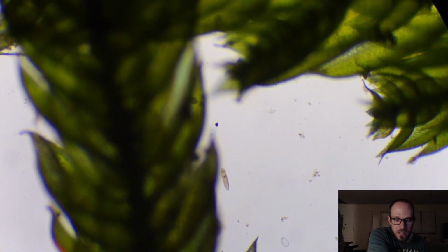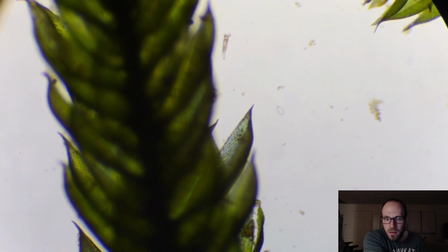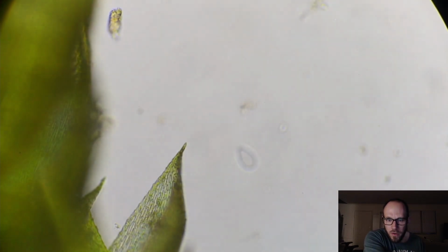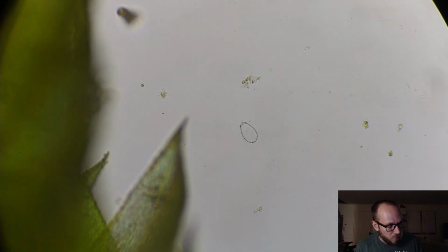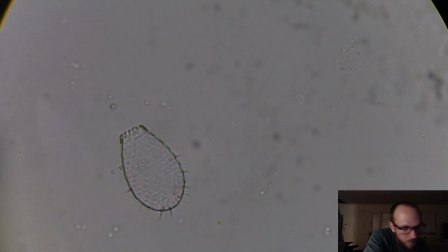So yeah, there he is, still doing his thing. And we're still in Brightfield. I'll let him be. I don't know what this guy is right here. We're at 100x now. I've seen a bunch of these. I don't know if it's an egg or what, but like, I'll switch to Darkfield. They have a very distinct shape, but I don't know what the hell they are. They don't move. They don't appear to be alive, but they appear every... Oh, wow. You see some detail on that thing. Interesting. I guess it's an egg.